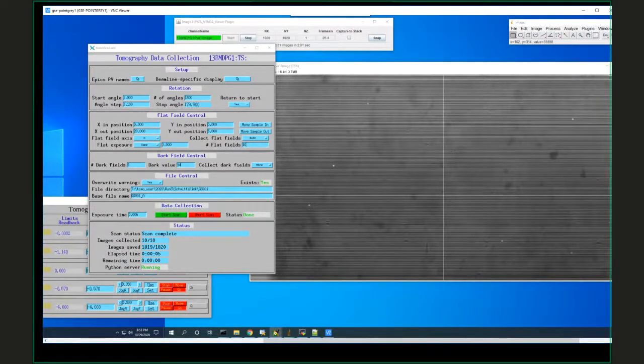I mean, it's basically just how efficient is it and how sharp is it? So I don't think it really affects how it reconstructs, except for the time it takes to collect and the quality. Potentially one scintillator might be sharper. Like, for instance, definitely when I went to the LUAG, this was back when I was using monobeam only. When I went to the LUAG at, let's say, 33 keV, because we did a lot of work at the iodine edge with the hydrology people, the LUAG gave significantly better images, all other things being equal, because the X-rays stopped sooner and we didn't have a depth of focus problem.